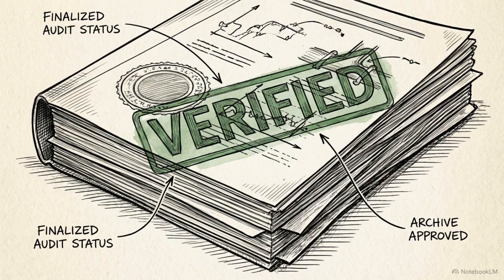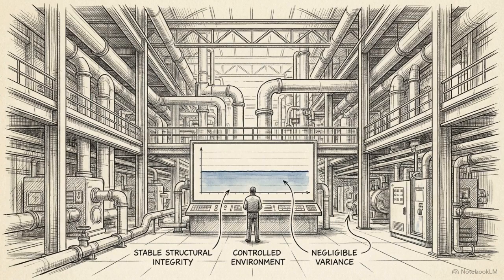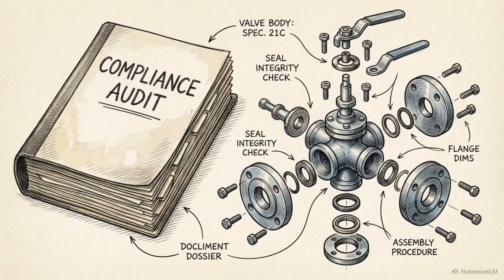Once you complete the checks, you compile your statistical charts, your dead leg geometric measurements, and your checklist findings into a formal internal audit report, presenting a documented history of trending the data, investigating the spikes, and correcting the physical flaws prior to hitting 500 parts per billion proves your system is under control. That paper trail is your defense against receiving a 483 warning letter from an FDA auditor.